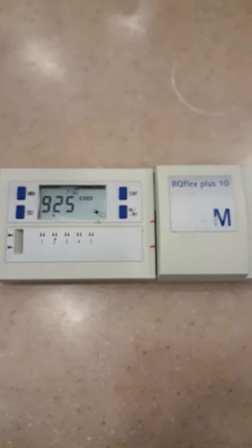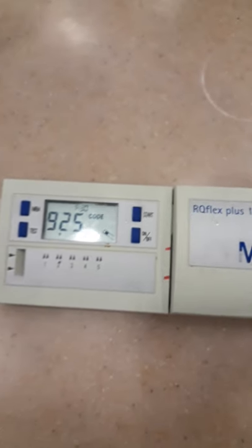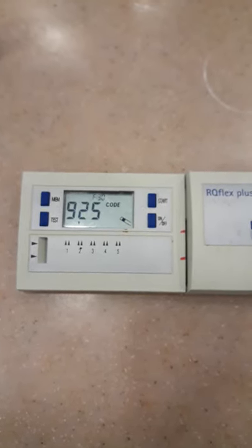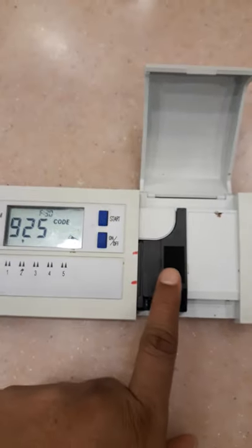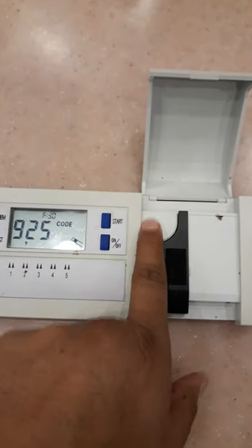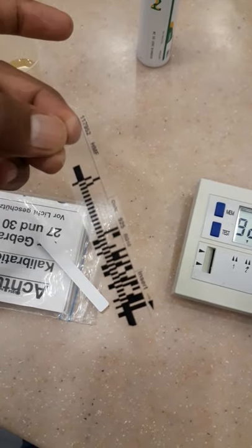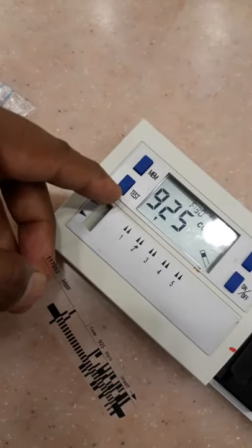Hello everyone, today I will show you how to calibrate the RQflex plus 10 if you are going to determine the enzyme hydroxymethylfurfural, called HMF, in honey. I already fixed the strip holder into the strip adapter. This is called the HMF barcode. I will show you how to calibrate.